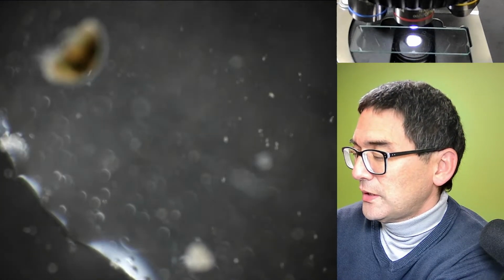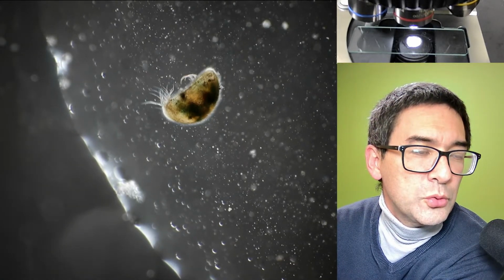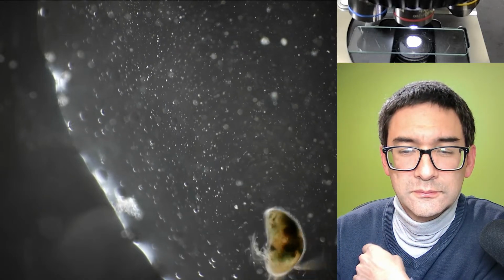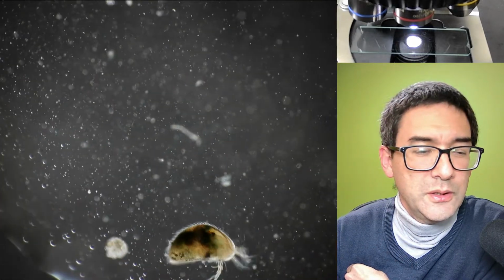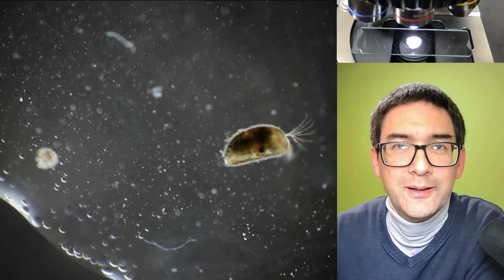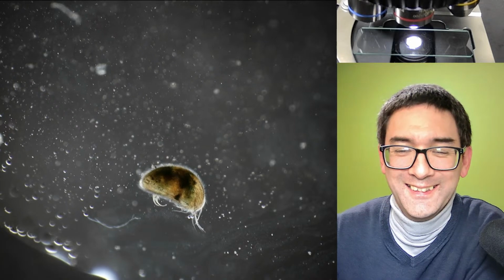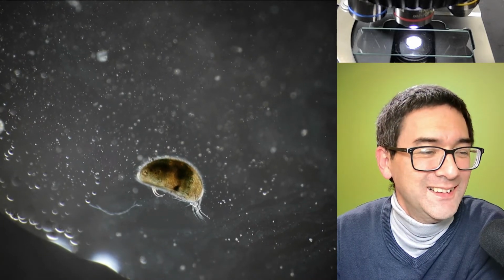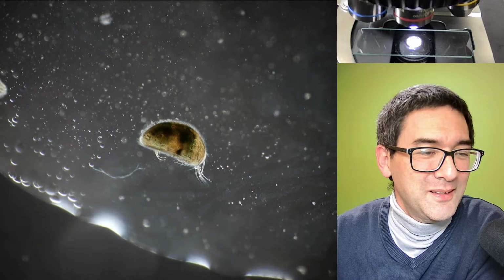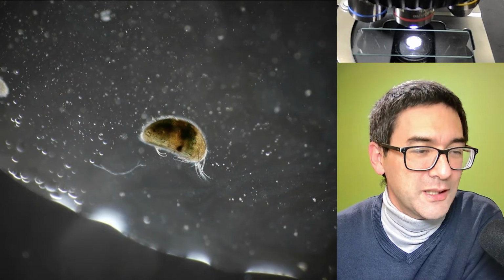That's why it's always a good idea not to make the water drop too big. So here we go. That's basically the little ostracod who also basically has passed the one chip challenge. And yeah, still going.